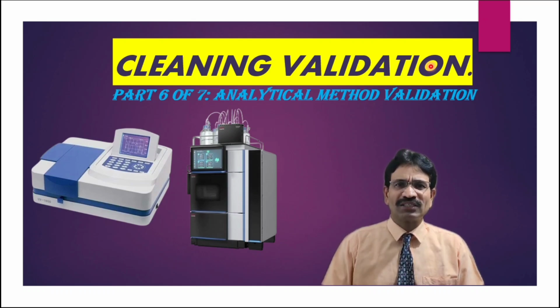Before starting this session, I would like to request you to visit all previous 5 sessions where you get basic idea about the cleaning validation, dirty equipment hold time studies, clean equipment hold time studies, then calculation of MACO values, how to design protocol, how to write report, everything is discussed in our previous sessions. In today's session, we are going to discuss the analytical method validation for cleaning validation, that is analytical method validation for swab or rinse residues. So let us begin.